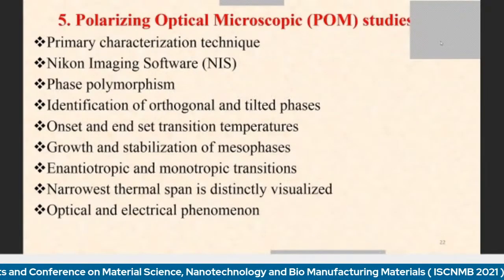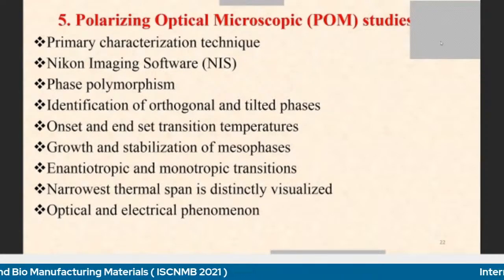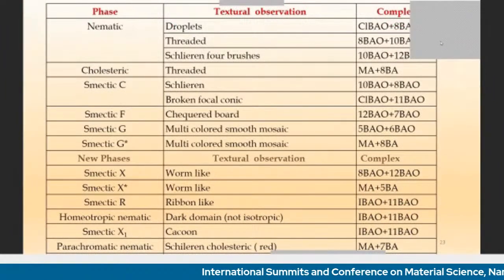And for optical and electrical phenomena, if you supply field energy, electrical field or thermal field, whatever it may be, the phenomena exhibited by the complexes can be understood from this POM investigation. It is such a beautiful investigation, and I will show you the textures later in my discussion.